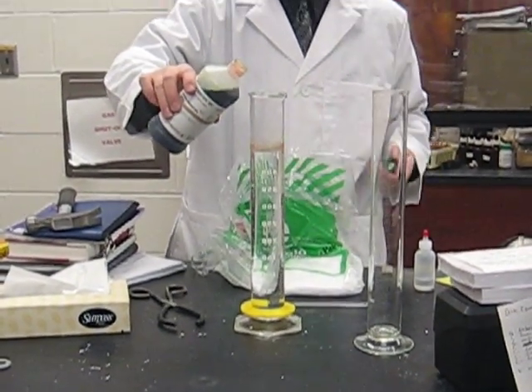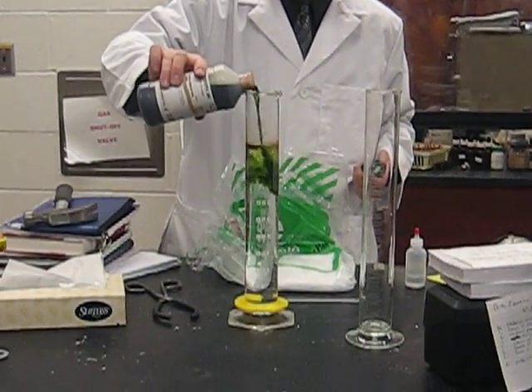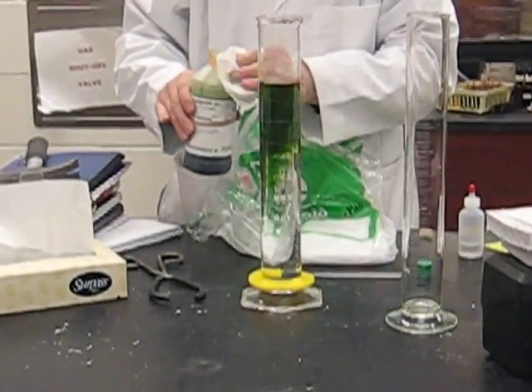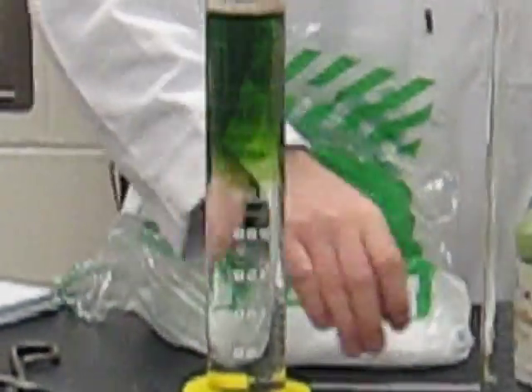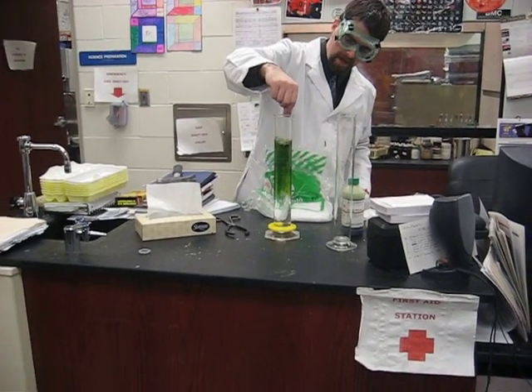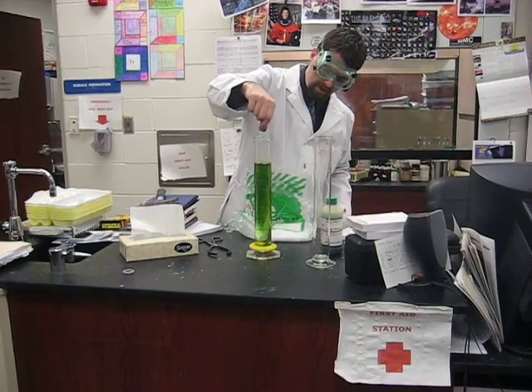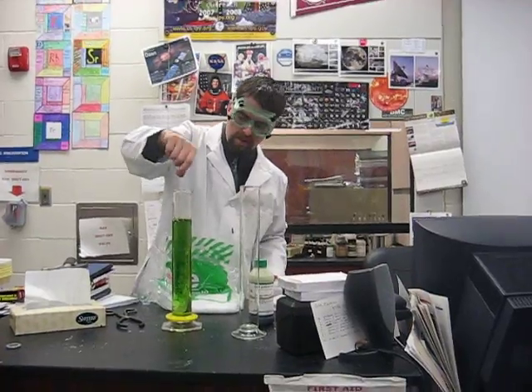I have here a graduated cylinder filled with distilled water, and I'm going to add a little bit of universal indicator. You'll notice it has a green color. Indicators change color in the presence of an acid or a base. Green happens to be the color indicators are when neutral. Universal indicator is really just a mixture of several different indicators.